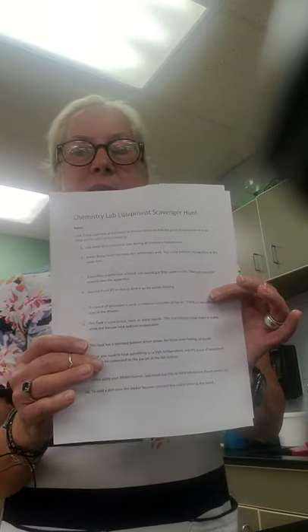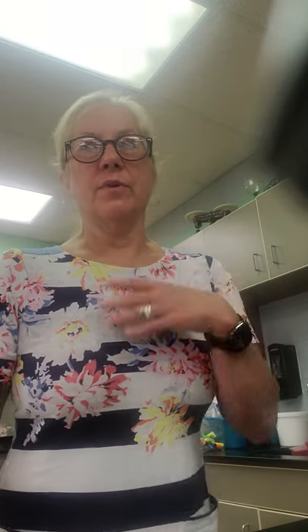Hi guys, we are going to go through the chemistry lab equipment scavenger hunt. I've posted this document on Google Classroom. Those of you in class have already gone through this, so this could be a review. Those of you who are out of class, this is how you're going to know what these things are.